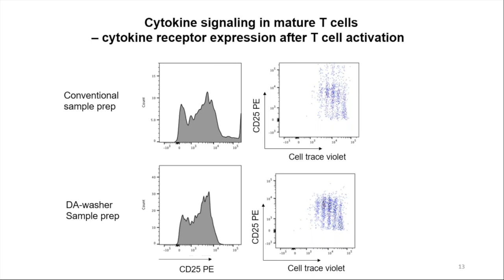We did one pilot experiment. It worked extremely well, and that was it. I think Elijah can probably tell you more about optimizing the stimulation on the plate itself, but even that was relatively straightforward. So you optimize by doing one experiment.